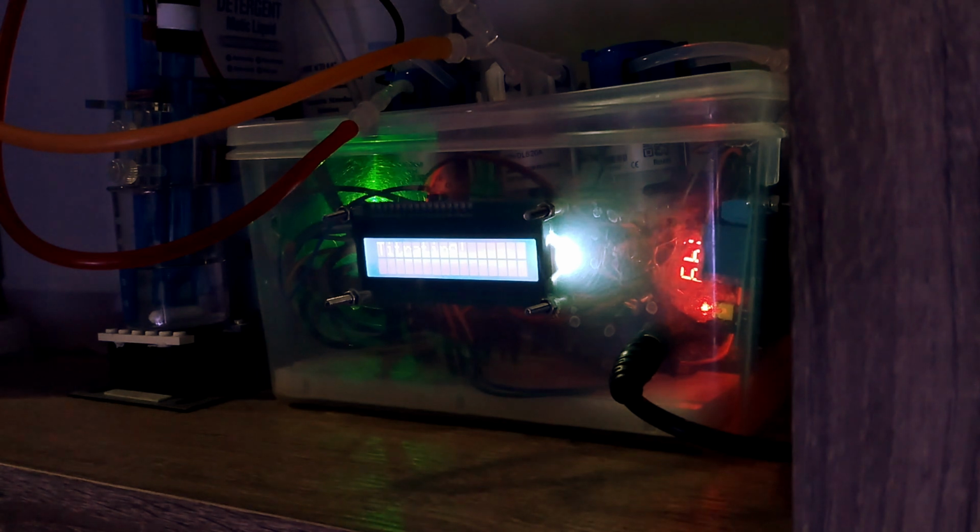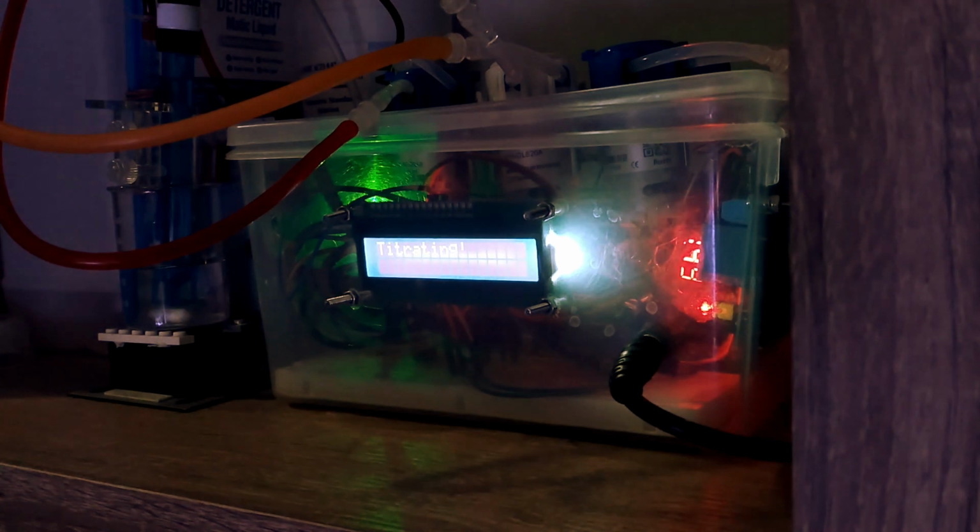The titration will use sulfuric acid with a concentration of 0.02 normality or 0.01 molarity, and then the sulfuric acid will be fed drop by drop into the reef tank solution sample. And as you can see, the Arduino Uno records the pH changes.